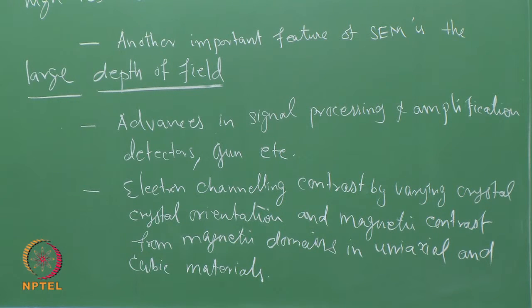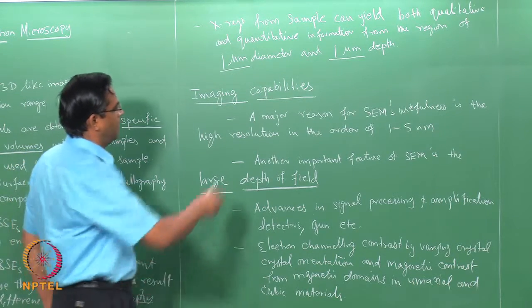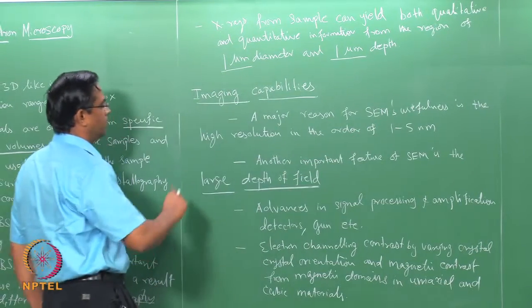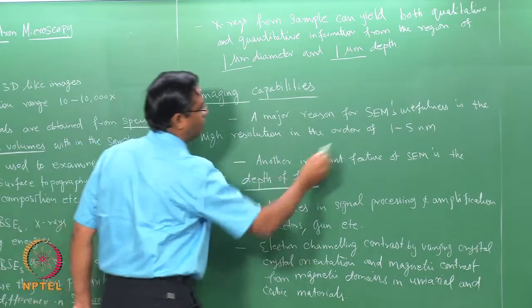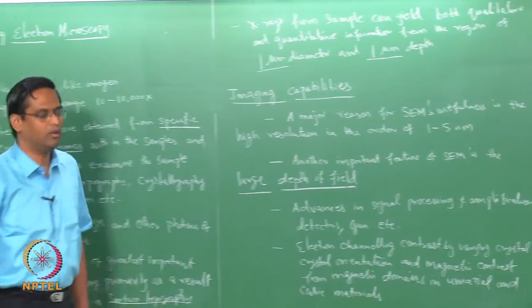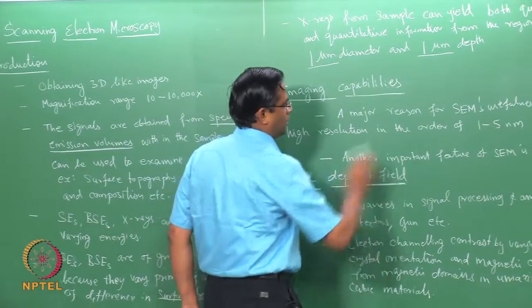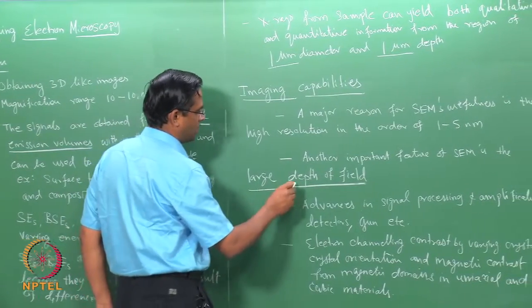So if you look at the imaging capabilities of this microscopy, the major reason for the SEM's usefulness is the high resolution, in the order of 1 to 5 nanometers. And another important feature of SEM is the large depth of field.